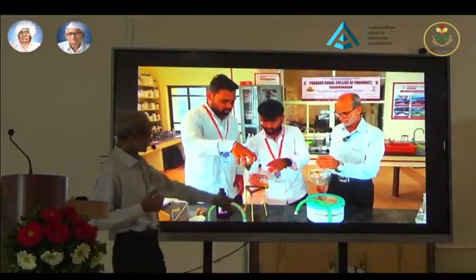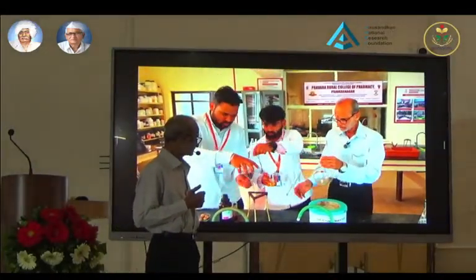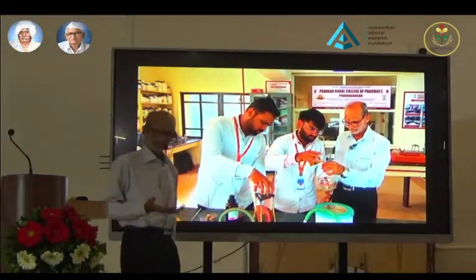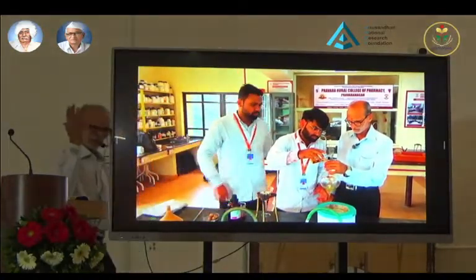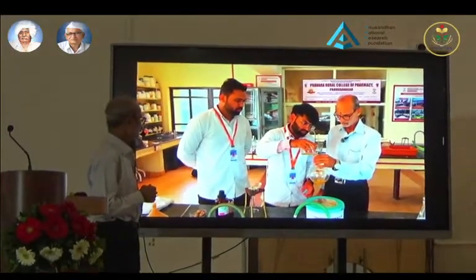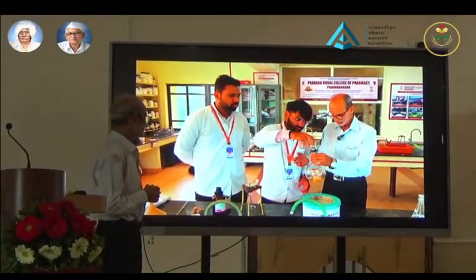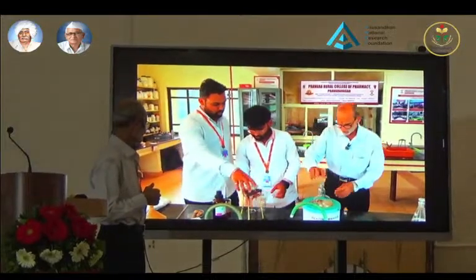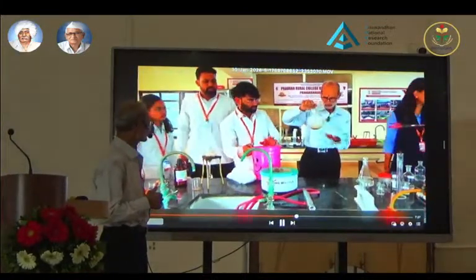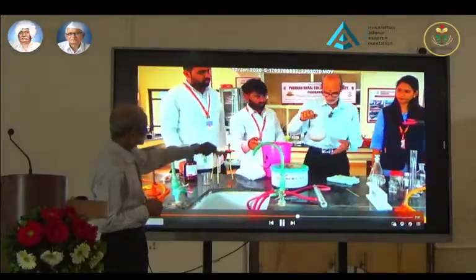All right, we are going to concentrate now. Since we were in a hurry, we allowed it to evaporate; otherwise you should recover the solvent. All right, this is concentrated now.